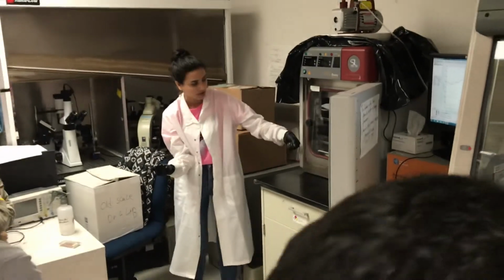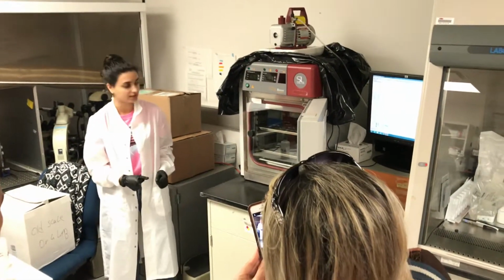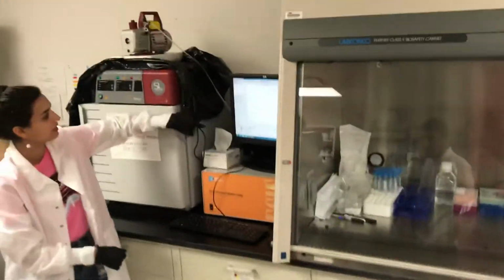Every one of those little gold ones goes inside of that. They have 8 pins that read from 8 channels, and each of the channels has cells inside them. Not beating right now, probably, they're growing. I cultured them yesterday.